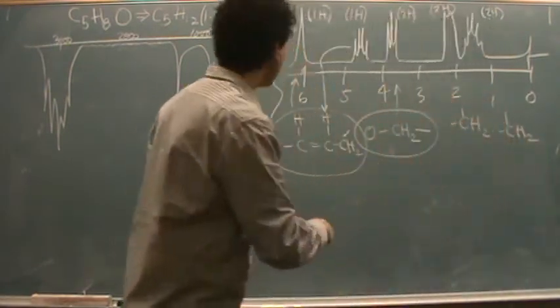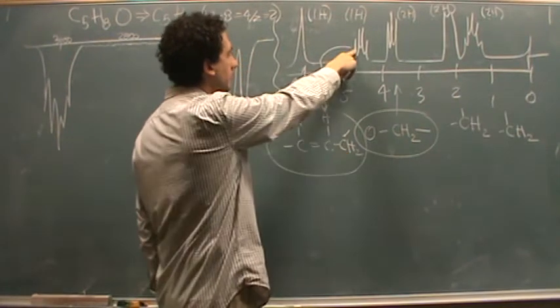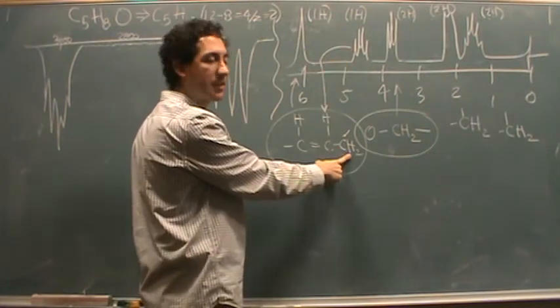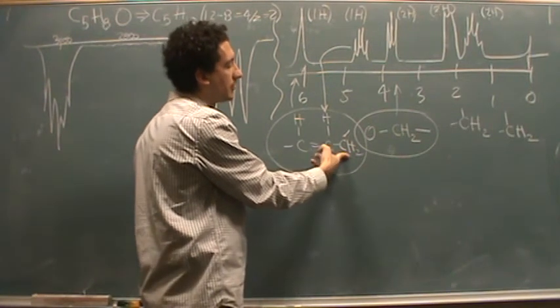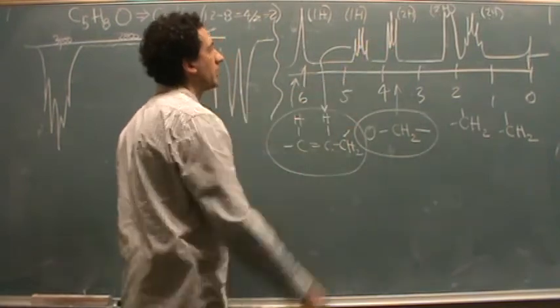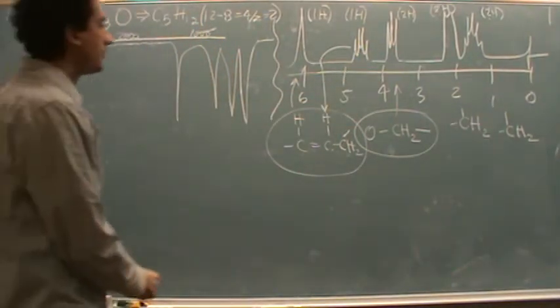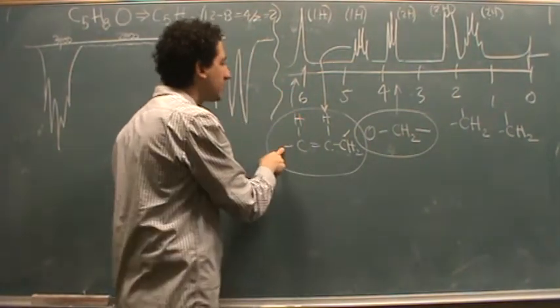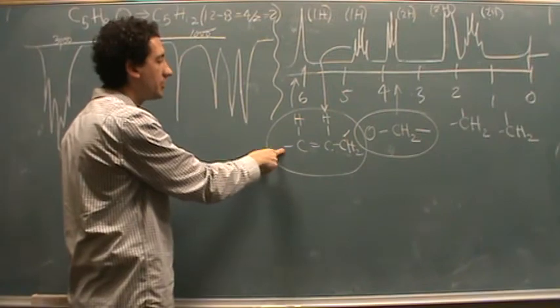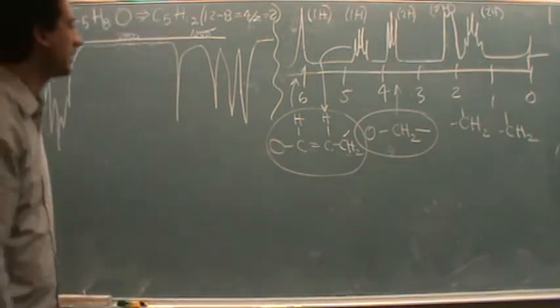Okay? So that's why I drew those over here. I didn't know how many. I know this is a multiplet, so I thought there's probably CH2s here. And I guess CH2 versus CH3 because all the integrations are 1 and 2. I think this side, since it's giving a singlet, is probably next to the oxygen. There are no hydrogens here to cause a split.